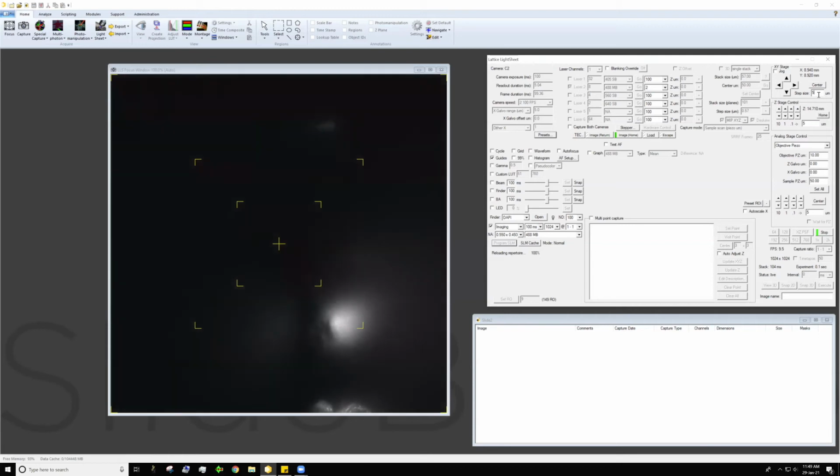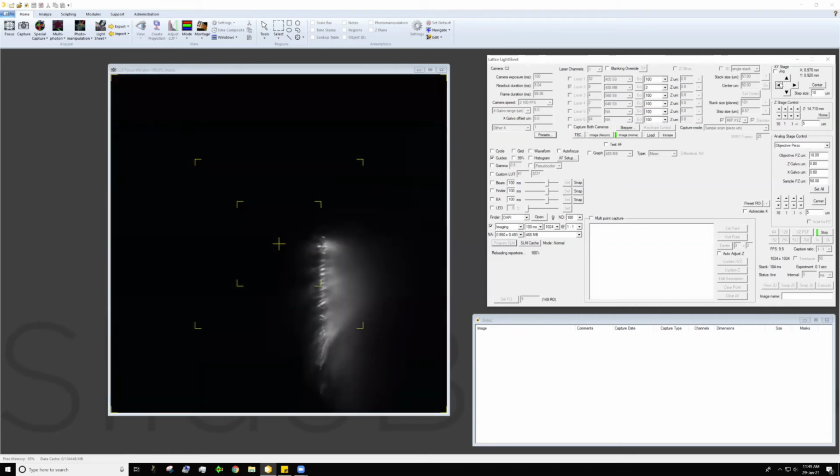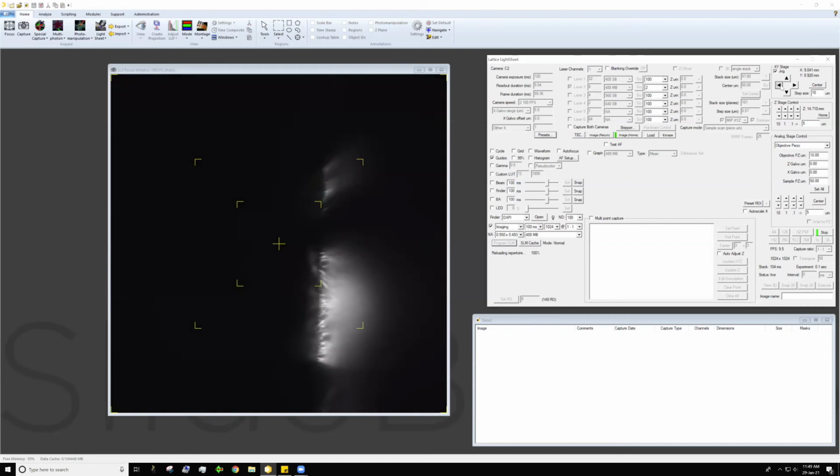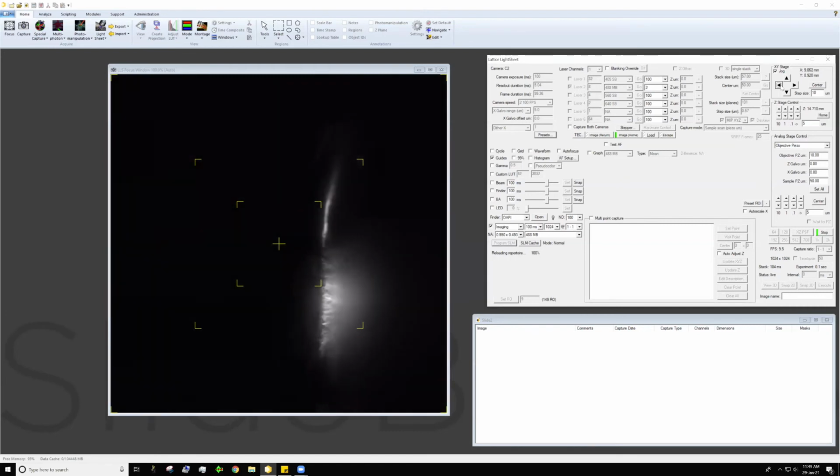You can change how far each click moves by changing the step size. Do not go above 15. Click on jog to reduce the number of times you have to click. Clicking an arrow once will set the piezo in motion in that direction, and clicking again will stop the jog.